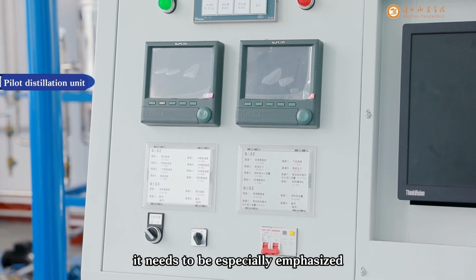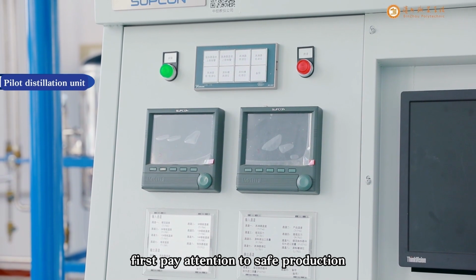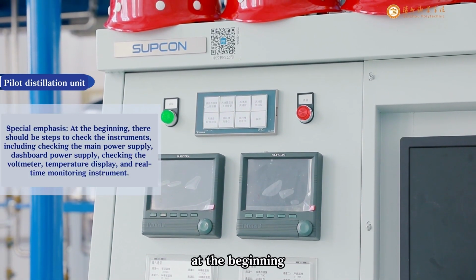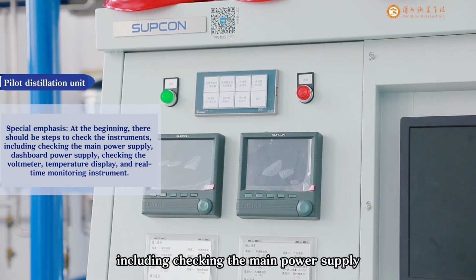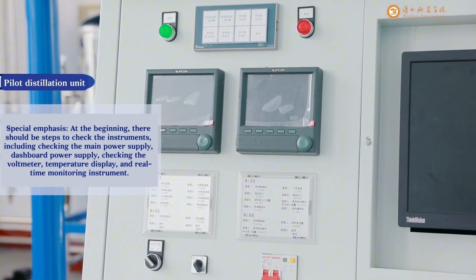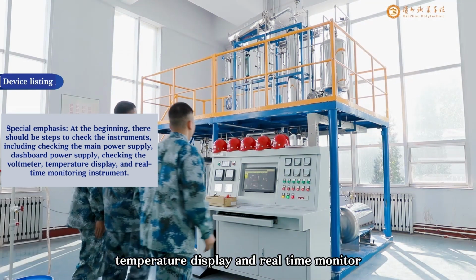It needs to be especially emphasized. First, pay attention to safe production. Second, operate standardly. At the beginning, there must be a step to check the instruments, including checking the main power supply, instrument panel power supply, viewing the voltmeter, temperature display, and real-time monitor.